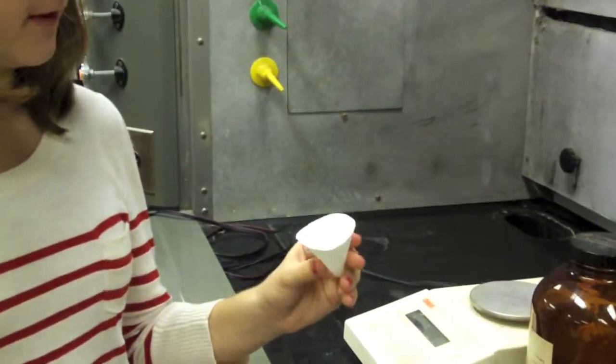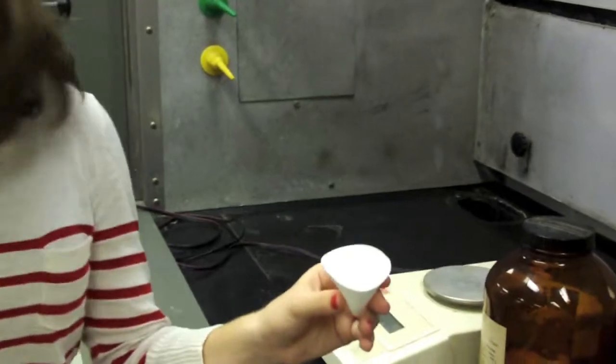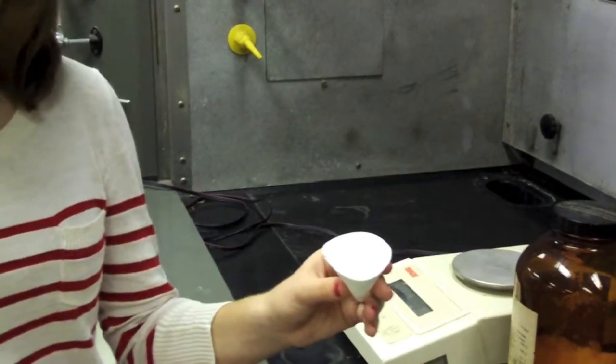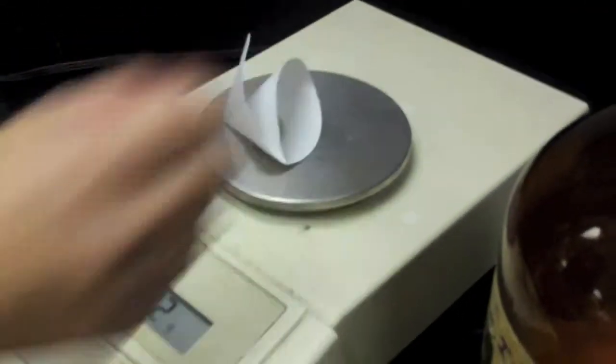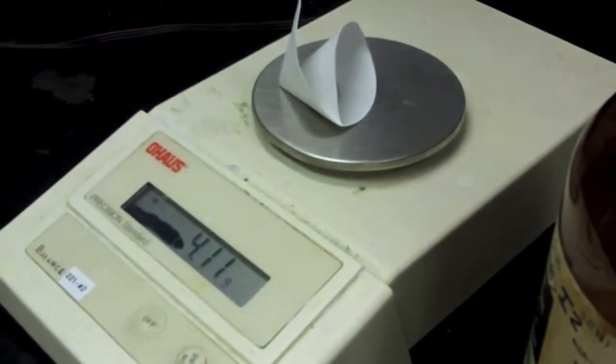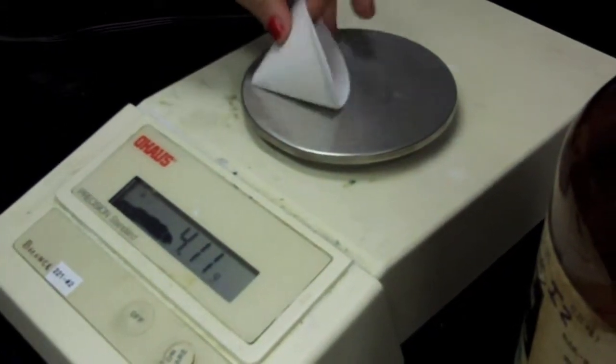After you waited for the filter paper and the solid to dry, you can take it out of the funnel and the beaker and weigh it. Again, make sure it's at 0.00 grams. Set it on. The mass of the paper plus the solid is 4.11 grams.